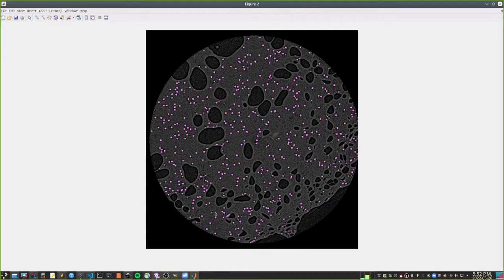There's a little bit of false positives, but they're very small. Yeah, it's almost perfect. But this is not a very high filling ratio of fibers. When there's a lot of fibers jumbled together, touching, it's going to be harder for the machine learning. Also these scans are clean and high resolution, so all that helps.